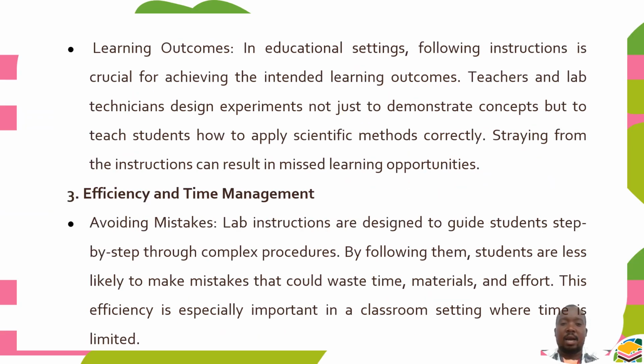So, learning outcomes. In educational settings, following instructions is crucial for achieving the intended learning outcomes. Teachers and lab technicians design experiments not just to demonstrate concepts, but to teach students how to apply scientific methods correctly. Straying from the instructions can result in missed learning opportunities.